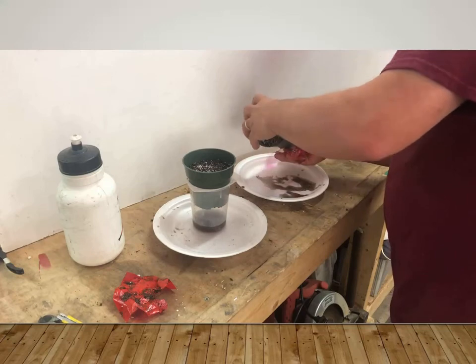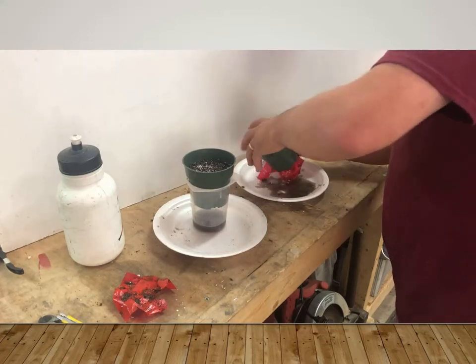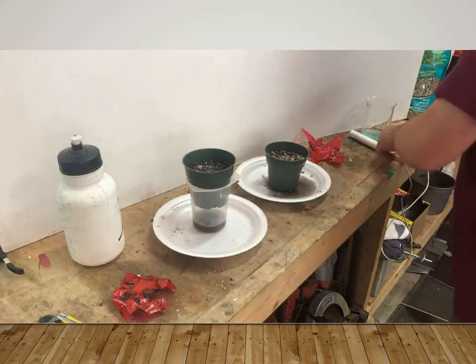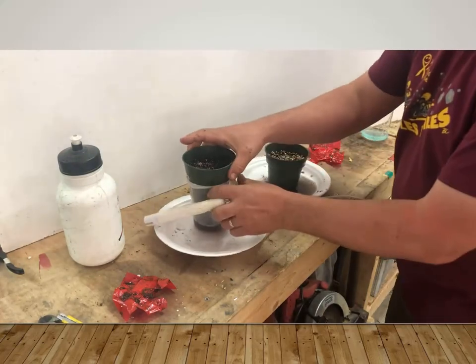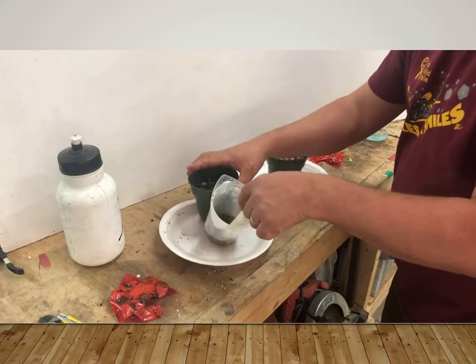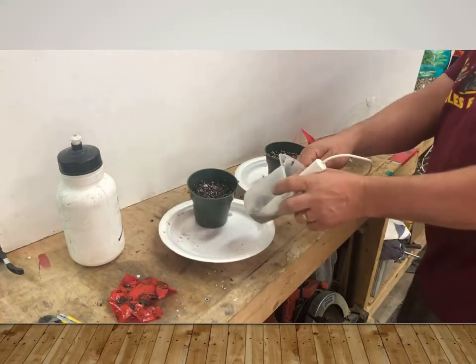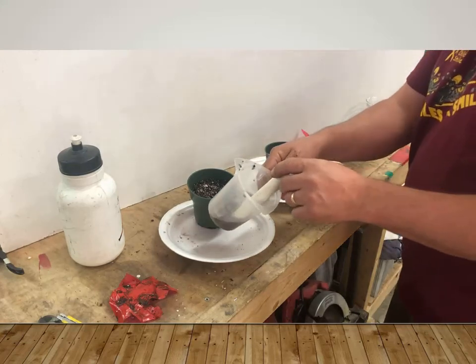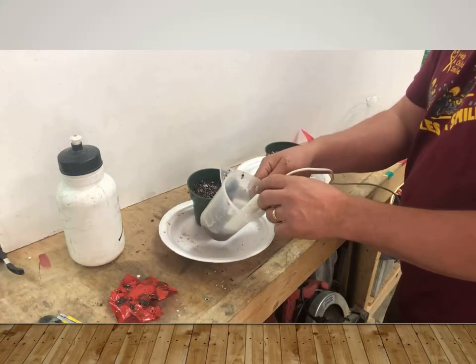There's a little coming out for my excess, but that's okay. We're going to do a pour through on what the soil's holding. I don't really want necessarily what the volume's holding. So let's wake this up. Take the sample off and measure the EC. What came out the other side? And lo and behold, what came out the other side was 4.5. Exactly what we put in.